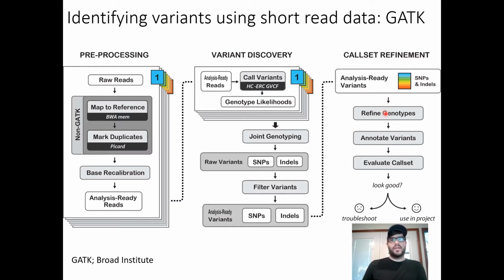You could go back and rerun the pipeline. You could run it against a standard set or something like that. So this is a very intensive process, but in general, you have to make a lot of decisions. So maybe 98% of your SNPs are going to be high quality, but the question is how many do you need and what thresholds are really important to you. So is it better to have more slightly lower quality variants or a refined set of really high quality variants? And that depends on the downstream analyses.